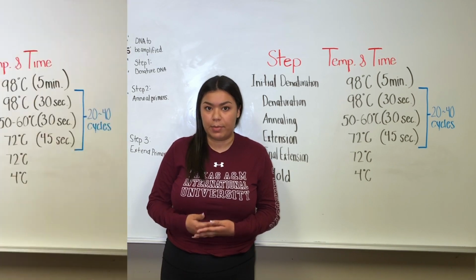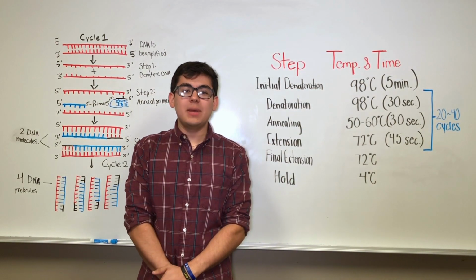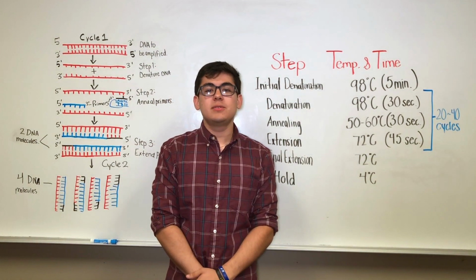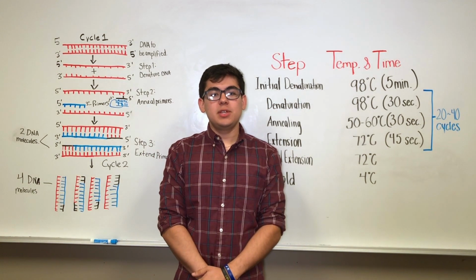during each PCR sample. Before we get into the procedure of real-time PCR, let me give you some background and introduce our materials that we'll be using. In order to get reliable and accurate results, proper instrumentation is required.